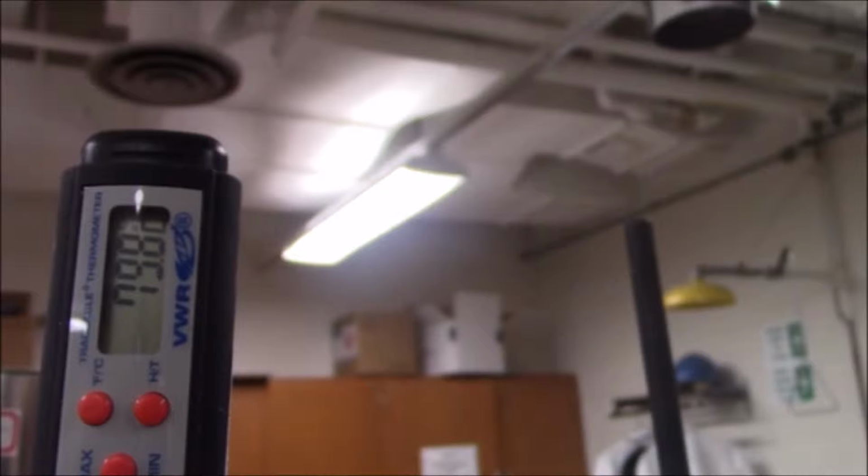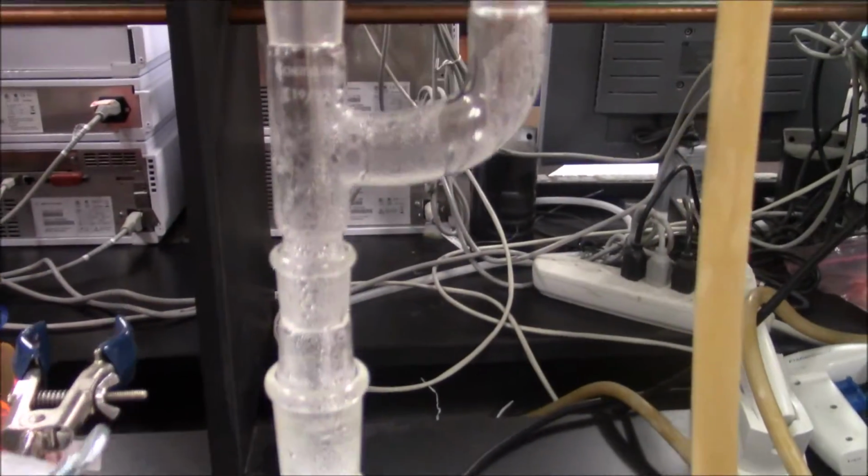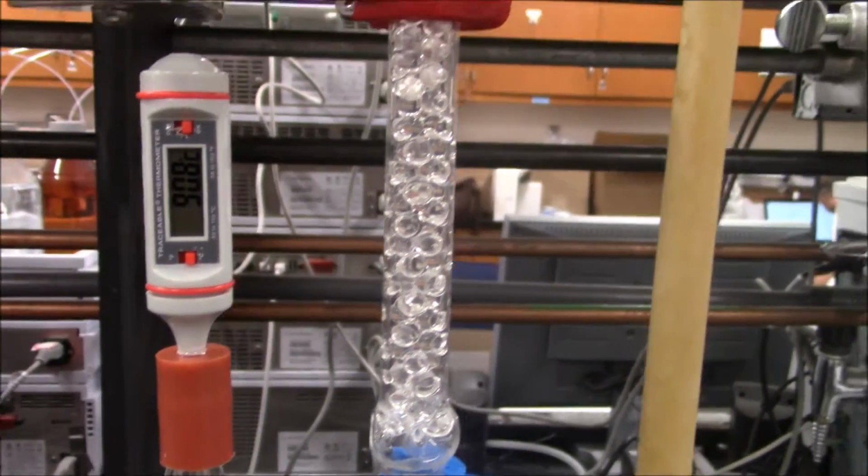For reference, the boiling point of ethanol is 78.4 degrees Celsius, while the boiling point of water is 100 degrees Celsius. At the beginning of distillation, the temperature of the vapor should be 70 to 80 degrees Celsius.